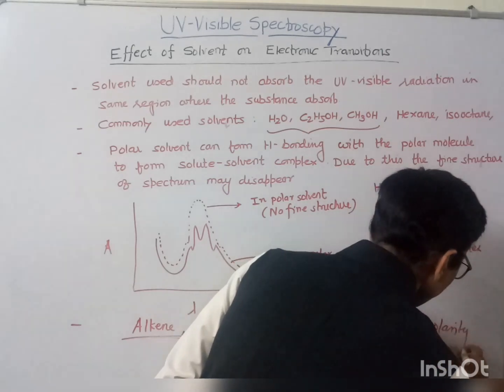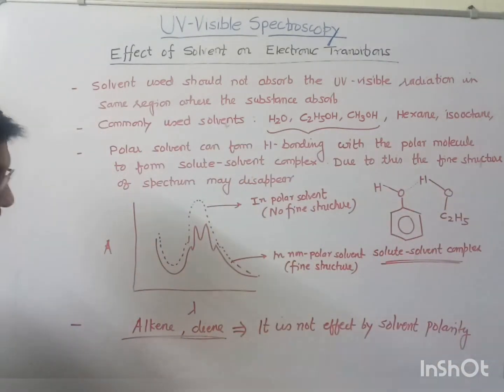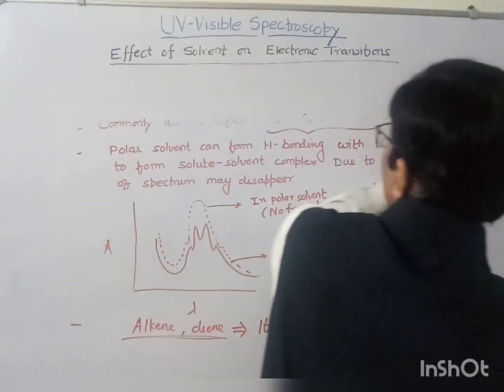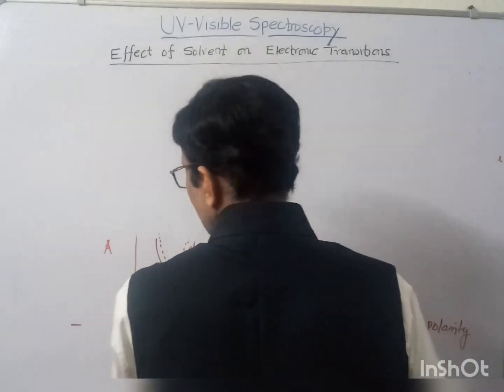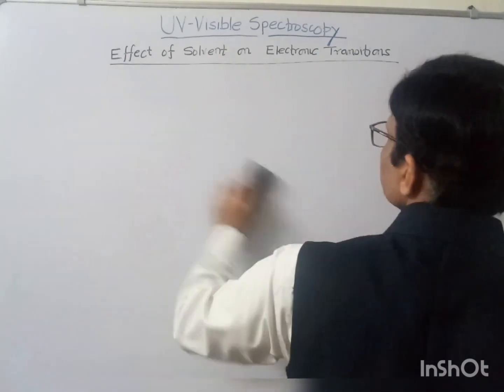Whereas if you are taking the spectra of some carbonyl compound, let us see how the transitions in a carbonyl compound are affected by the solvent polarity.